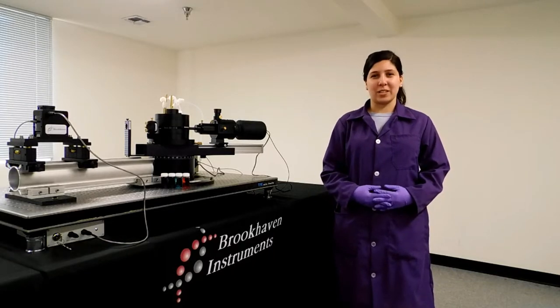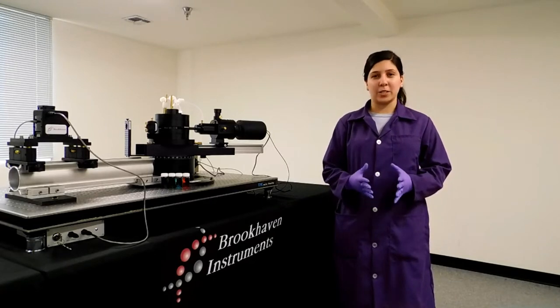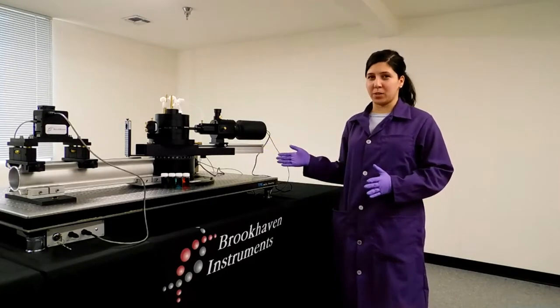My name is Dana Castro, and I'm an application specialist here at Brookhaven Instruments. In this video, I'll be guiding you through an alignment of our research-grade goniometer system.